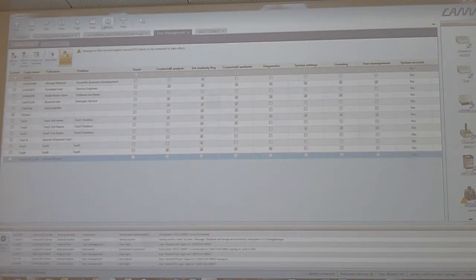Then if I go to options and regulatory settings, this is only active when I have 21 CFR 11 active. And if 21 CFR 11 is active, you see in options view license, you don't see it here because the beamer is not very good, but here it says 21 CFR 11 is green, is active.